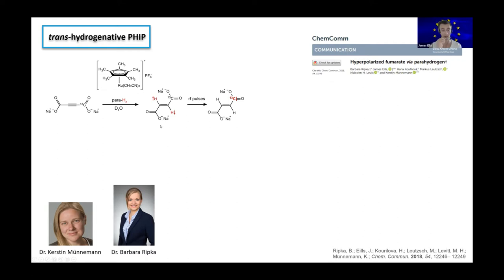The problems that they were having were with the reaction chemistry. It's a very slow reaction in comparison to the cis hydrogenations that a lot of people work with in acetone or methanol. This is much, much slower. It turned out, by adding some oxygen scavengers, Barb was trying different oxygen scavengers in the samples, she added one molecule, sodium sulfite, which just enormously increased the rate of reaction by 1 to 2 orders of magnitude. And this was like a real breakthrough. This took that reaction to being something that we could actually produce these molecules with up to a few percent polarization on the carbon 13 spin.